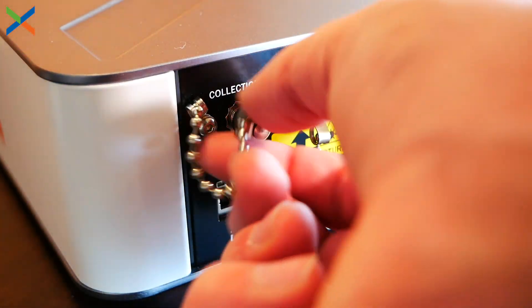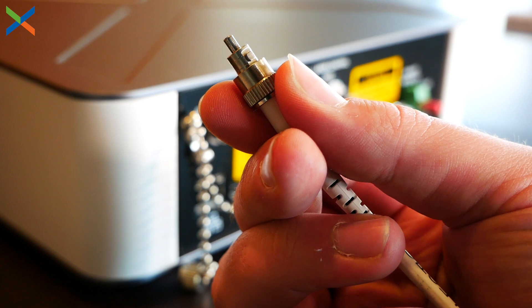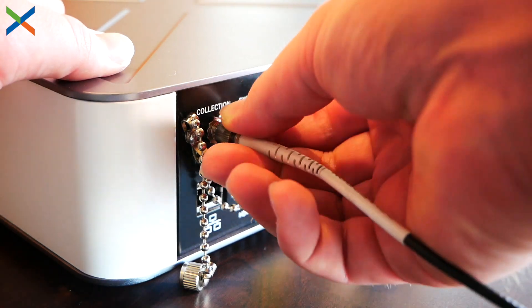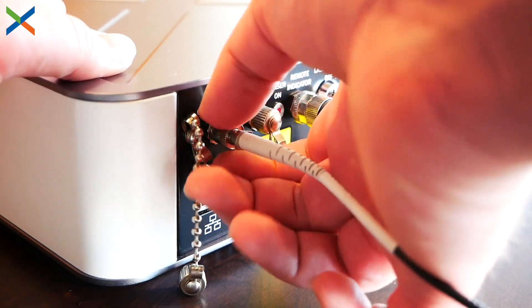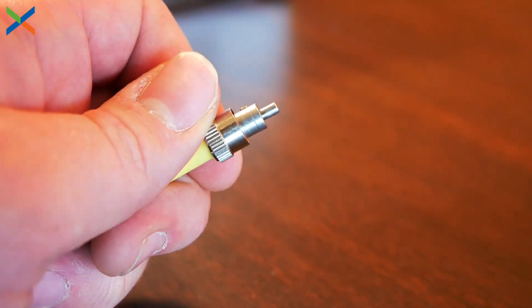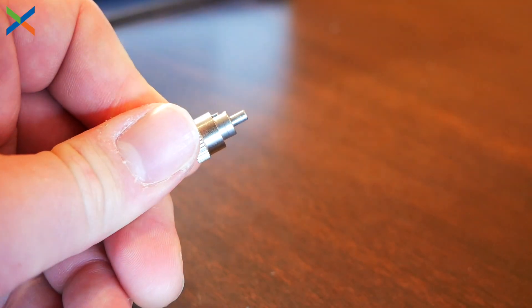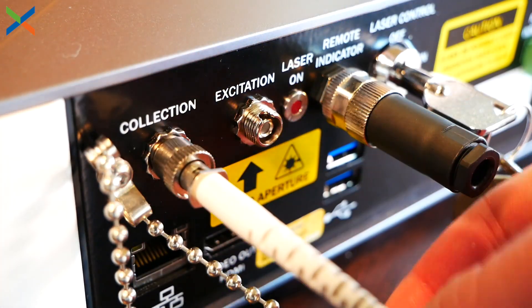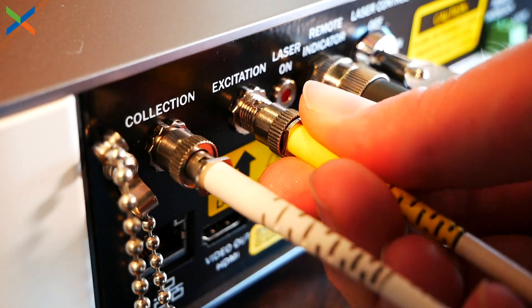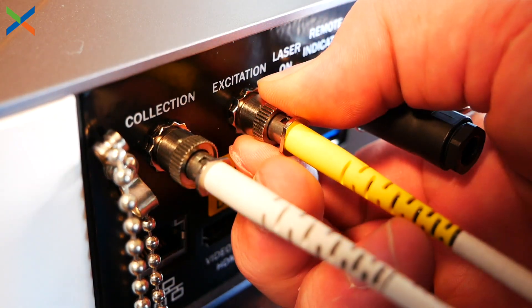The white one is the collection cable. Unscrew the cap on the box — you'll notice there is a key to align. Line that up on top, go in at an angle to make it a little bit easier, push it in, you'll feel that it's spring-loaded, and then finger tighten. It doesn't have to be too tight, but make sure it's not going to go anywhere. For the next cable, again take off the dust cap and make sure not to touch the end with your fingers. Unscrew the silver part, take the dust cap off, and clean it — anytime you plug or unplug the collection and excitation cables, make sure to clean the tips. Unscrew the cap on the back of the system, line up the keyhole, and finger tighten. Now the ball probe is plugged in.